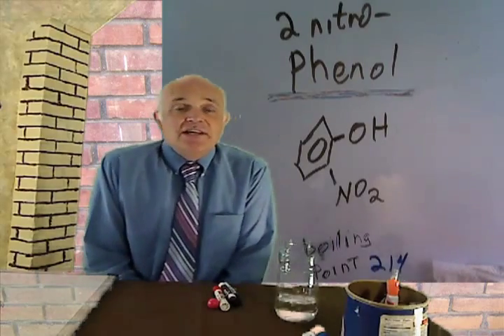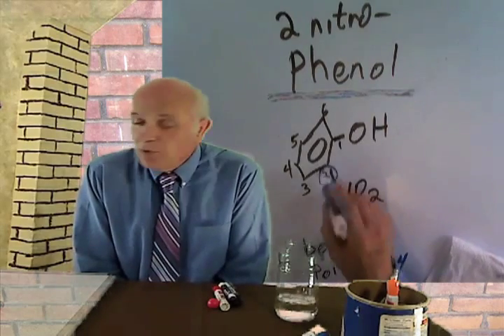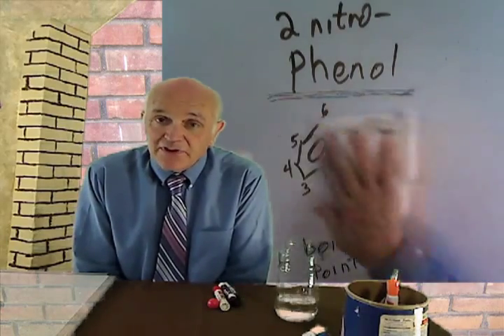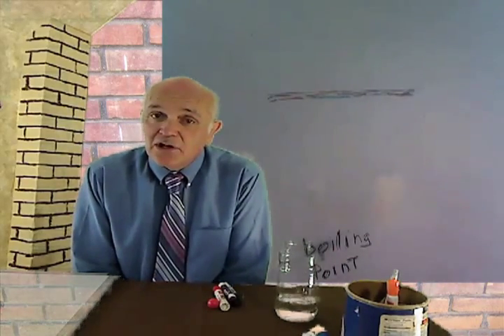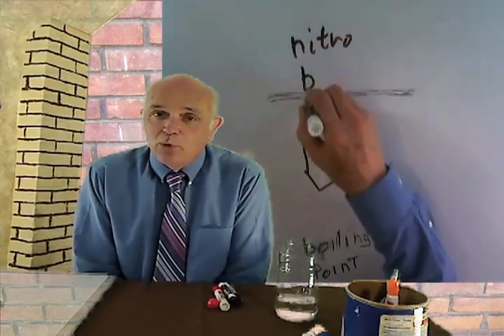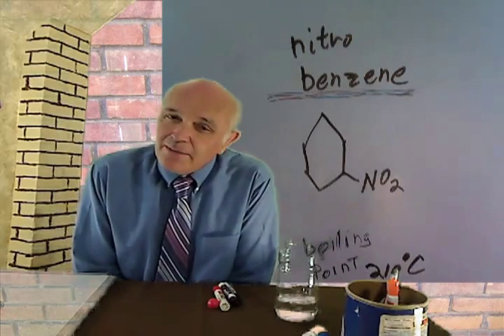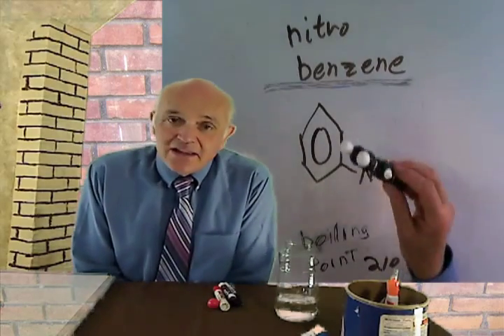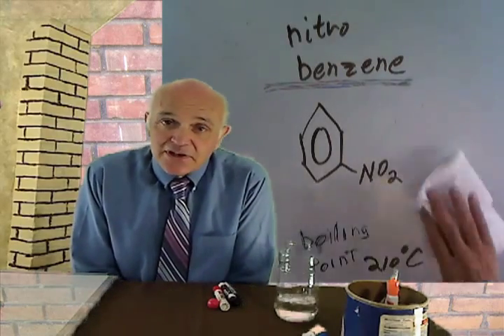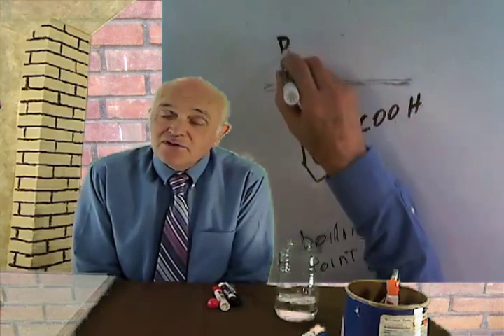The complication is that, again, let's take naphthalene, which has a boiling point of 218 degrees centigrade. So it doesn't boil very easily at all. It dissolves nicely in methylene chloride. So the methylene chloride is bubbling off, and naphthalene comes to the surface. Naphthalene doesn't boil anywhere close to 40 degrees centigrade, but it will evaporate. And the reality is that if you just blindly heat, the methylene chloride will boil off nicely, but you're going to lose a lot of your semi-volatiles.